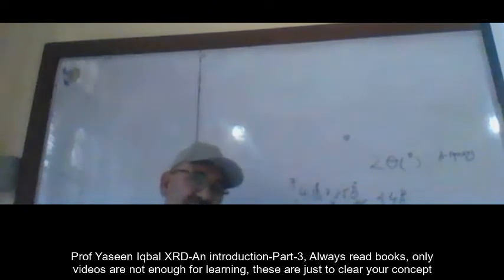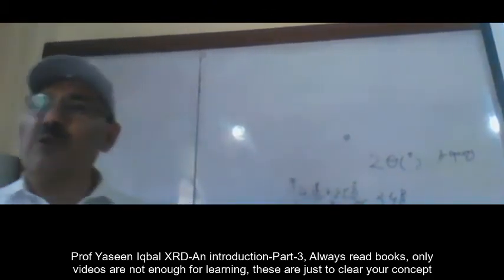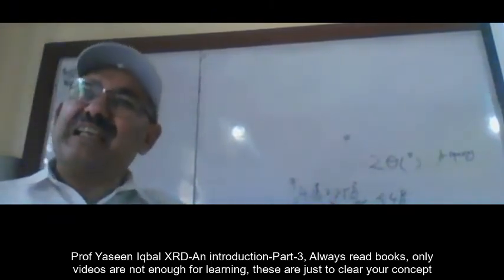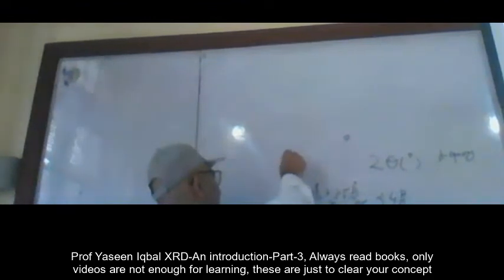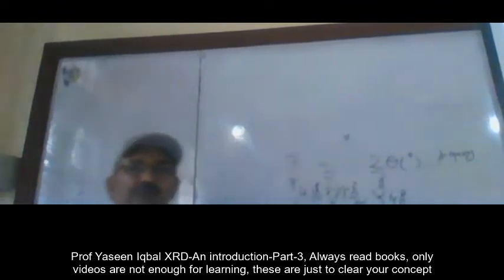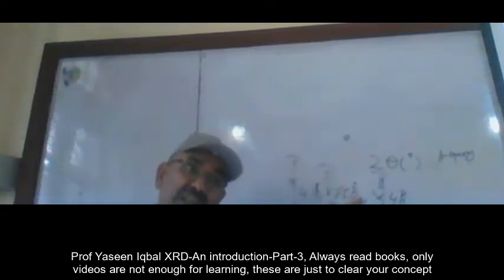If the material is well known, then you can convert it into HKL indices as well. If you say, instead of these spacings, give me HKL indices, it will give you 1, 0, 0, 1, 1, 1, 1, 0, 2, or 1, 0, 4, whatever it is, right? In this way they also give you, but only when the material is known.